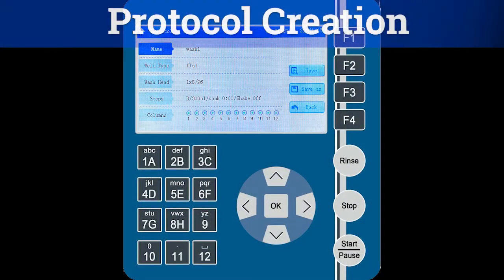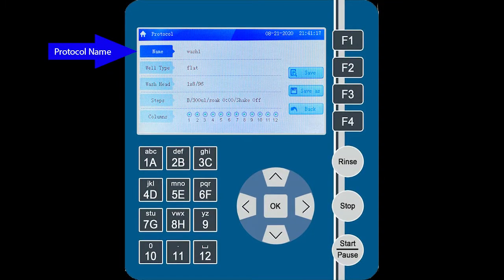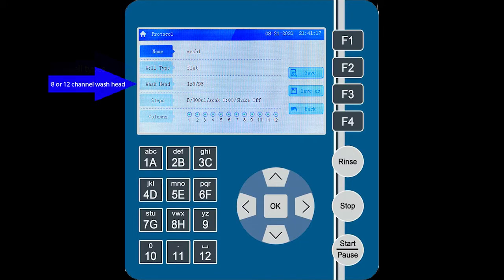Creating a wash protocol is quick and simple. First, start with the name of the wash protocol, which is entered using the keypad on the machine. Next, choose the well shape for the ELISA plate that is being washed. Then choose whether an eight or 12-channel manifold is being used.